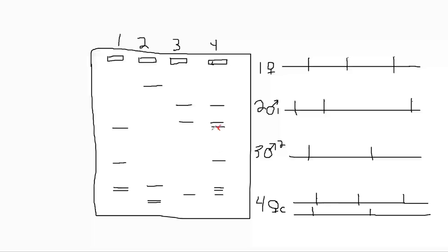So this is the mother's contribution to chromosome, let's just say chromosome 4. Here's another contribution, and then we can get rid of these two. So we're left with a segment here, and a third segment here. Now it's pretty straightforward. What we're doing is trying to find the other individual whose fingerprint matches these fragments.